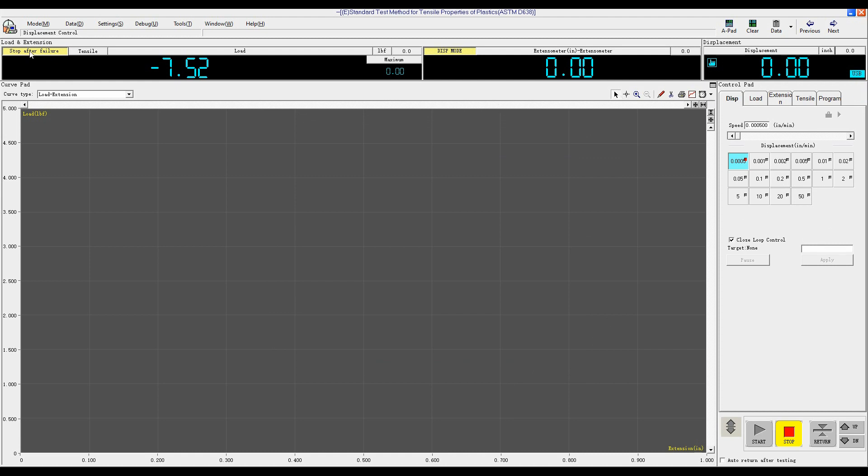The stop after failure should be in yellow color. When the sample breaks, the software can automatically stop. Here is the tensile compression mode. Click into Tensile.